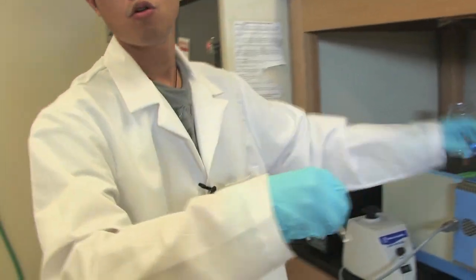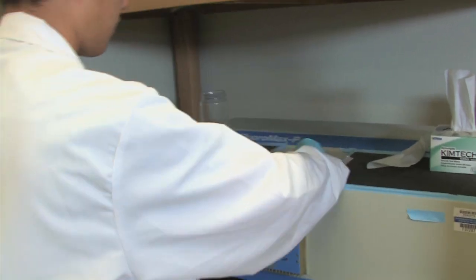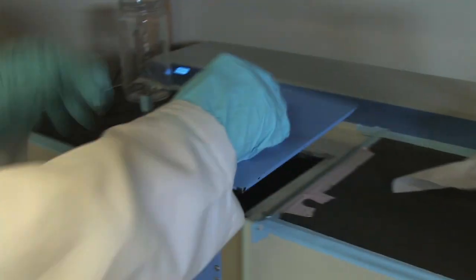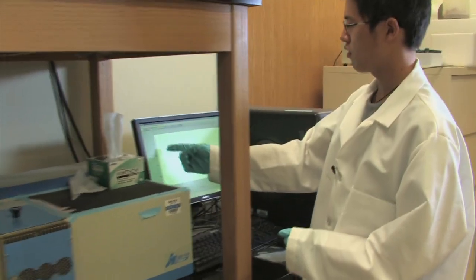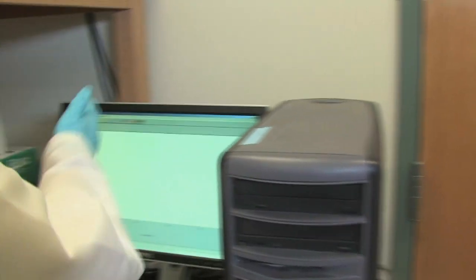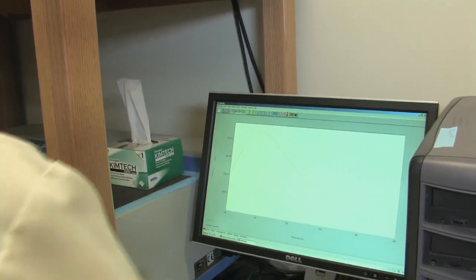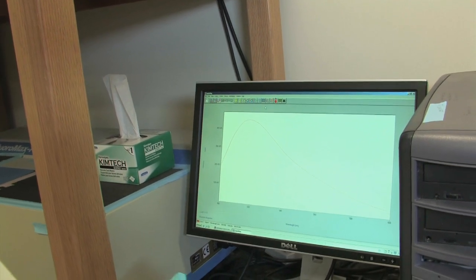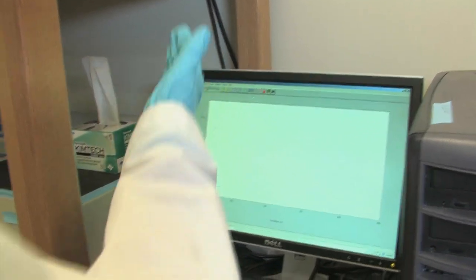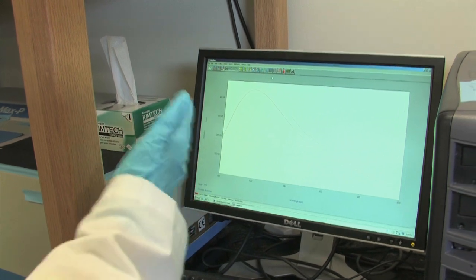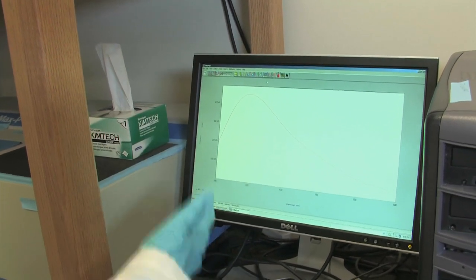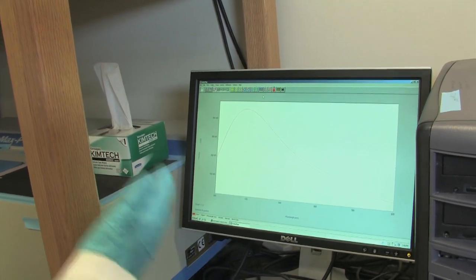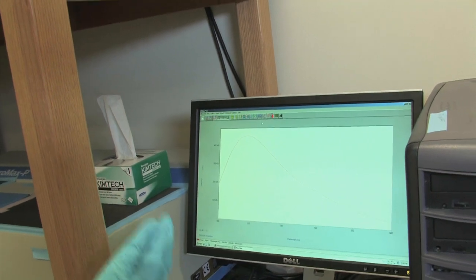We do another sample with some lead, then put this back in the fluorometer. It's pretty simple. Now for the sample with some lead, we get a similar curve, shape is similar, but the intensity is much, much higher. It's now about 4 million, so this sample has a fluorescence intensity like 10 times of our blank sample. With some lead, you will see 10 times the increase of fluorescence.